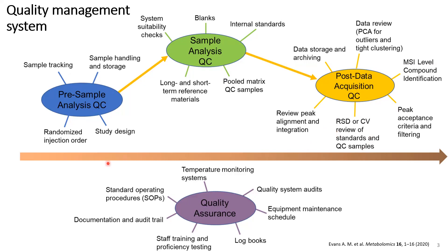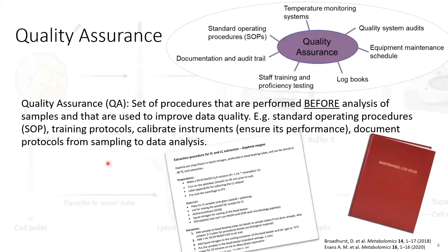Then you have the quality assurance system, which happens before any analysis — standard operation procedures. It could include monitoring of temperatures in the room, power data, and logs of the instruments. Instruments follow a maintenance schedule, including how often we calibrate the mass spec — all of that should be within the quality assurance systems, documentation, and audit trails. If there are any changes to the standard operation procedures, or if any samples undergo a different procedure from the others, you document it accordingly.